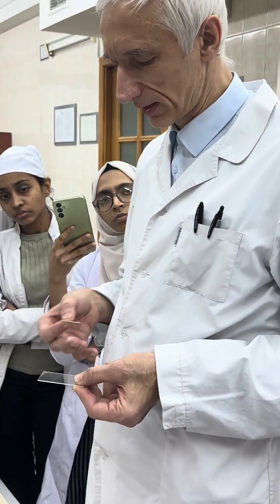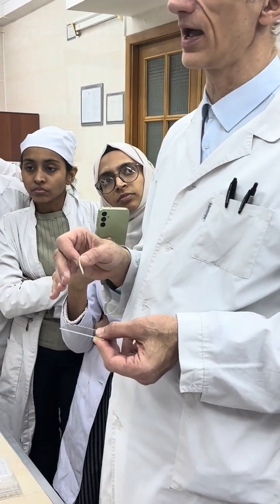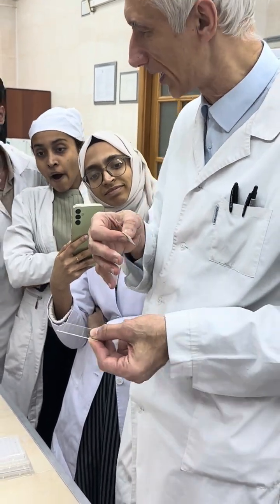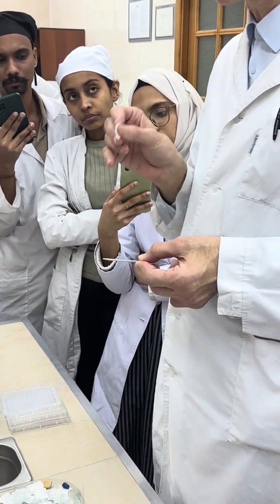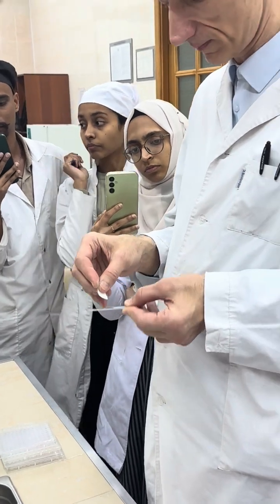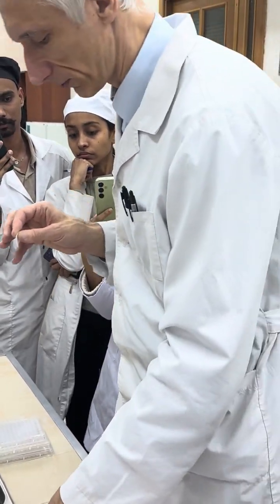By the way, this slide making I am explaining, I read, as I said 2 weeks ago, totally according to Koch. It means like in 1895 we did something like this, honestly speaking, very similar. So people, the soap should be removed. If you use 1, 2, or 3 papers, no problem. The central part of your slide, your oval, should be totally clean. It's visible.